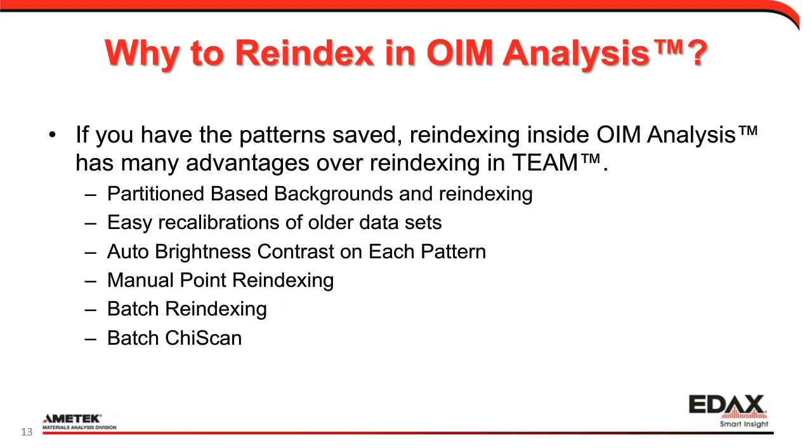So again, the other reasons I should be reindexing in OIM Analysis in general is that if I have the patterns saved, it gives me a whole bunch of different advantages over reindexing inside of TEAM. I already mentioned this, but the partition-based backgrounds are a game changer.